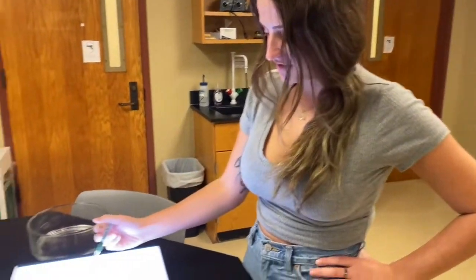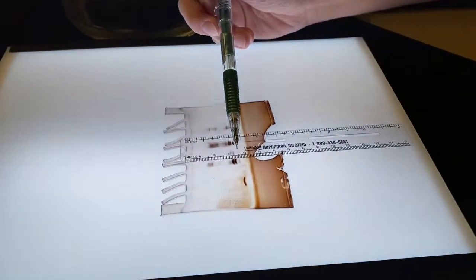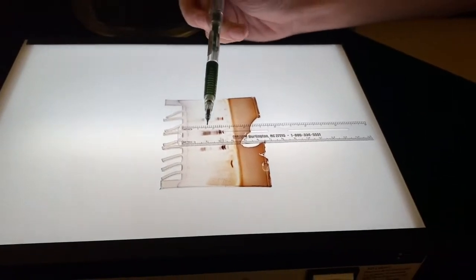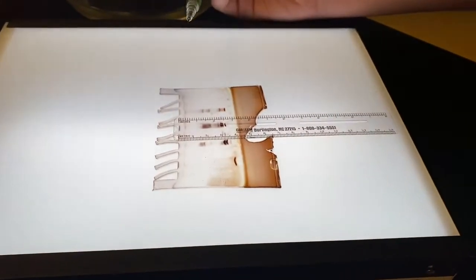Here we have our gel which has been stained with a silver stain. On the gel you can see the bands here and what we are doing now is measuring the distance the bands have traveled from the bottom of the well and this will allow us to determine the size of the proteins and enzymes.